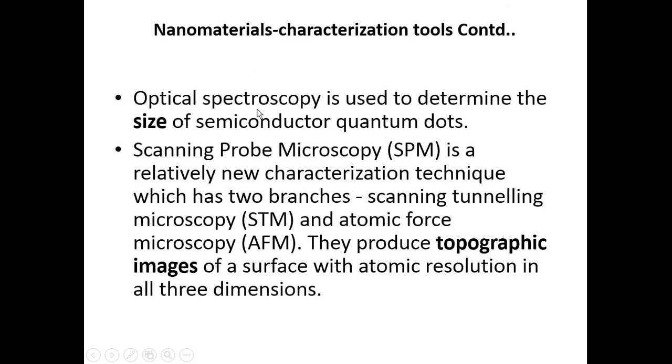Then optical spectroscopy is used to determine the size of the semiconductor quantum dots. In order to know the size of the quantum dots, we can rely upon optical spectroscopy.